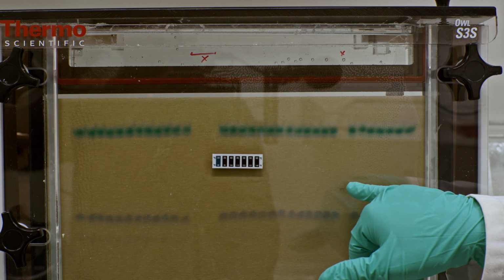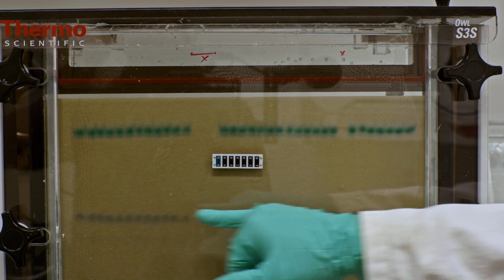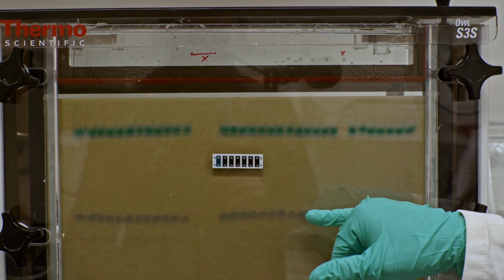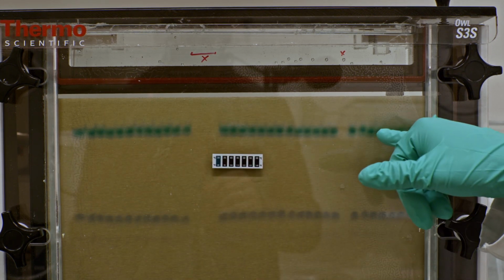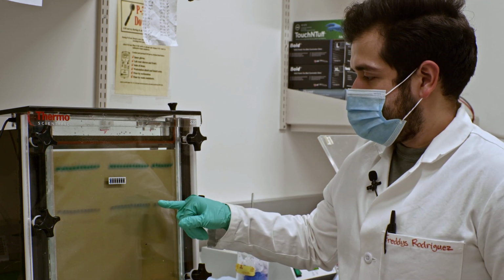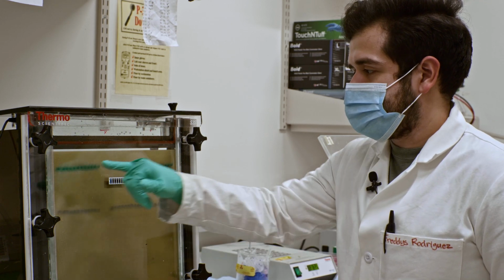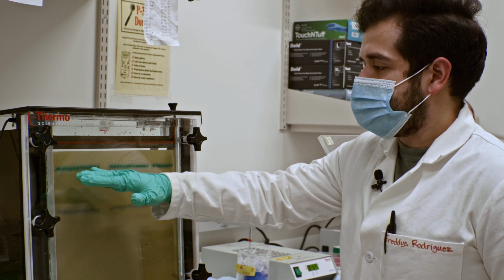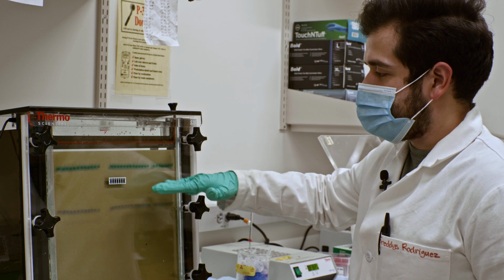Another thing to know about the quenching solution that we used previously, it actually has two sets of dyes, this much lighter blue and this much darker blue-green color. This system was devised in such a way that this lighter blue band, as you can see, runs further on the gel than does this blue-green dye. This indicates that all your radioactive material should actually be in between these two dye fronts.